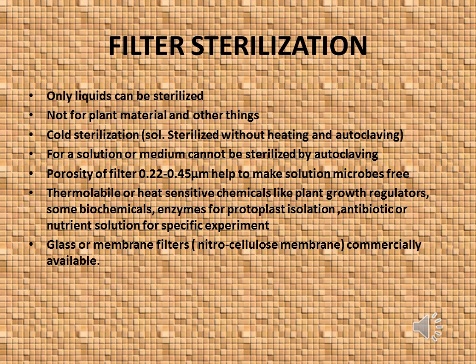Filter sterilization. Only liquids can be sterilized by this method. This method is not used for plant material and other things. It is also called cold sterilization because the solution is sterilized without heating or autoclaving. It is used when a solution or medium cannot be sterilized by autoclaving.